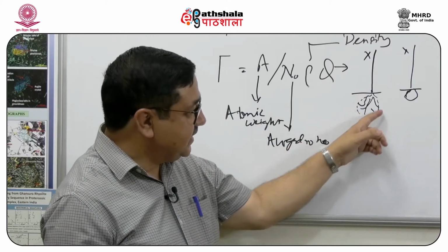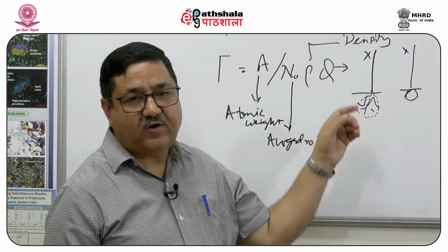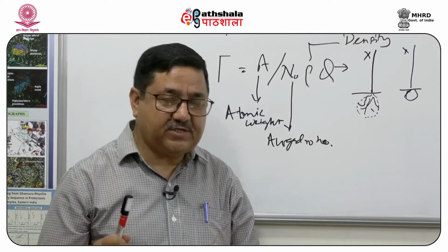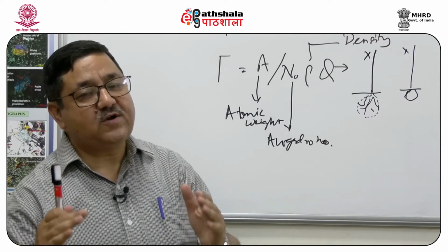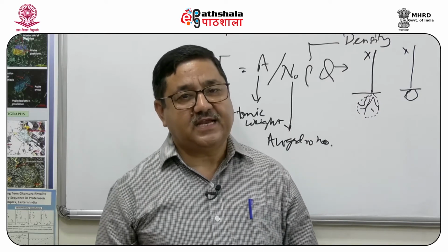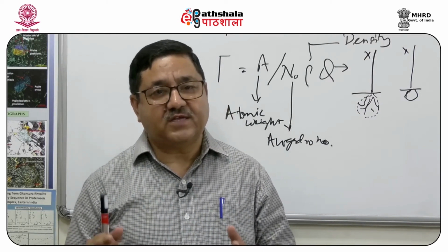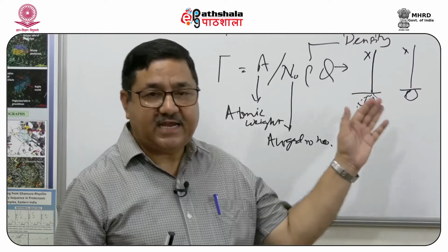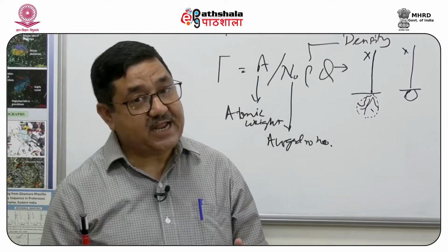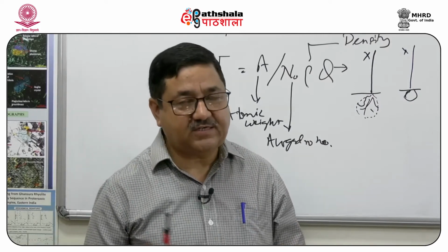As you see, the interaction is in a volume, and the interaction defines the volume in which the incident electrons are losing all their energies. When they are losing all their energies, following the law of conservation of energy, that energy will be transferred into some other form, and that helps us as a microscopy function also.